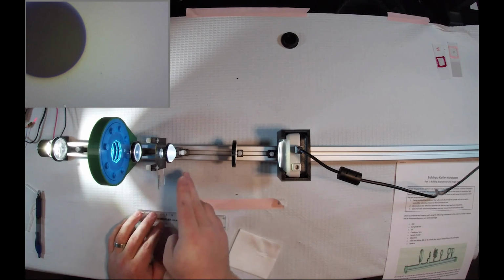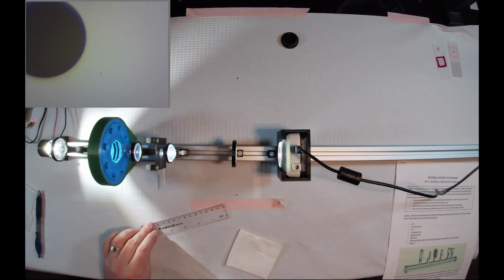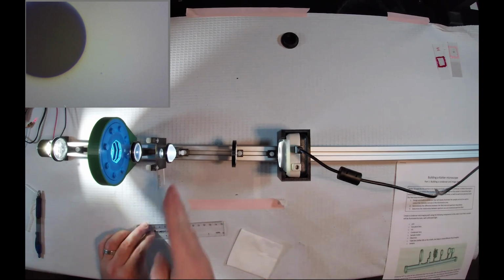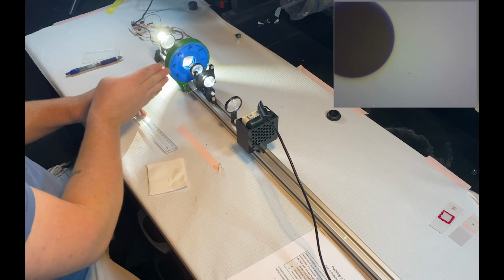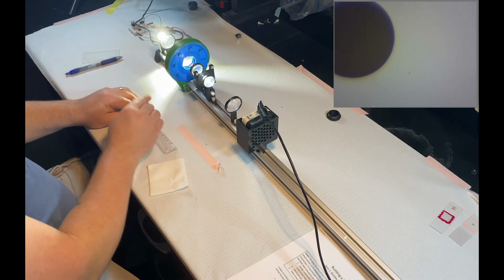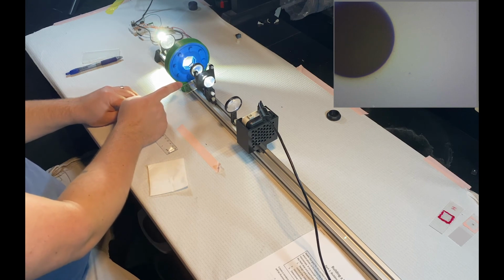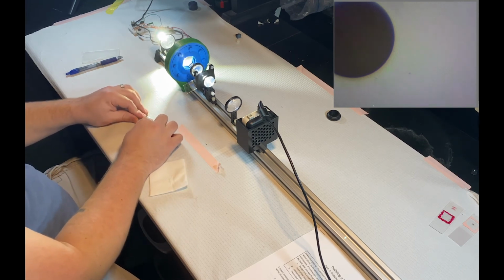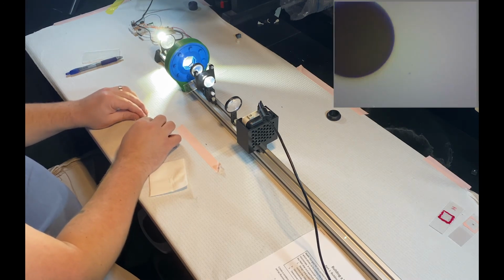Again, this focal length is only about 20 millimeters. So what is restricting the numerical aperture of this illumination system right now is not the objective lens, it is the condenser. So you should only need the diameter and the focal length of the condenser in this calculation to calculate what is the numerical aperture. All right, so you should go ahead and run through that.